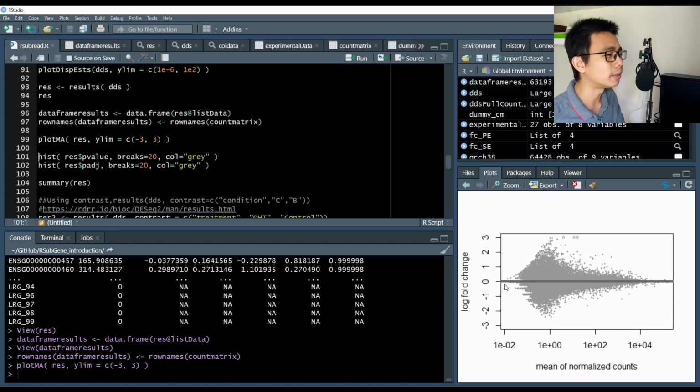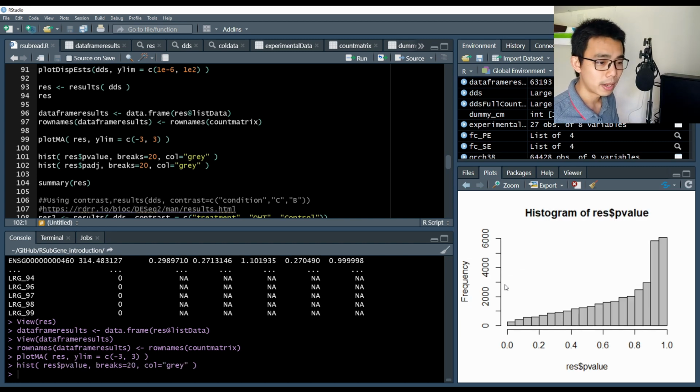And the next one is usually scary. We're going to filter based on our p-value and p-adjust. If you look at our p-value and use a cutoff of 0.1, it's not that bad. We have about 5 to 10% of DEG.